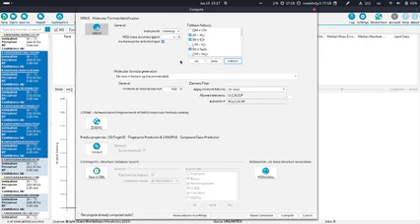So we cannot, I mean, for the adduct detection, it can distinguish them from the LC-MS. Like you see there's a certain mass delta and the peaks correlate. Then you can assume, okay, it's probably an in-source fragmentation. The method also looks into the MS/MS. So if you have two peaks that correlate with each other, and in the MS/MS the one is a subset of the other one, that's also a strong indication that this peak is an in-source fragment of the other one. So that's all done automatically in the pre-processing.